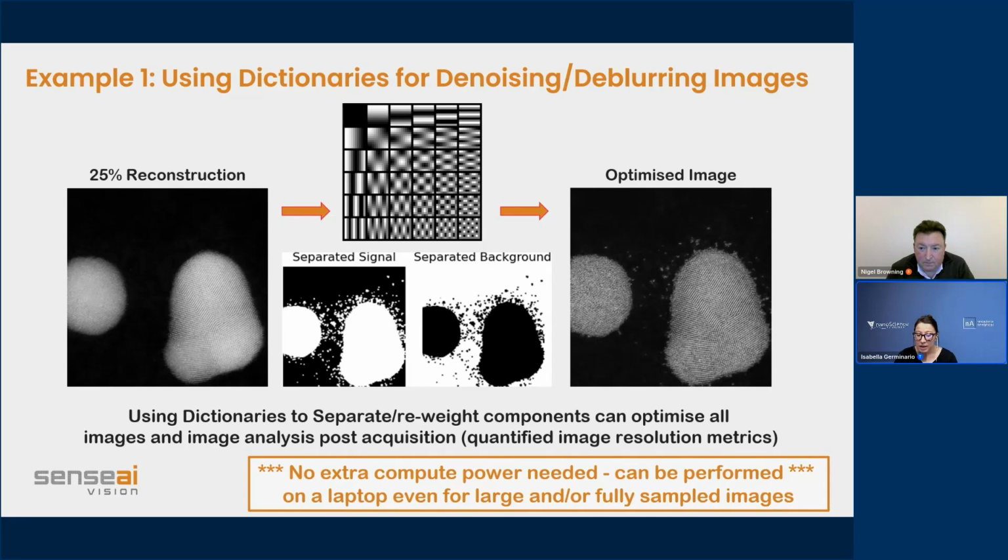So can Sensei also work to visualize electric fields with low dose? Yeah, so if you can get an image contrast out of a microscope or an imaging system, then Sensei can help with that. What it doesn't do is change the contrast mechanism. It doesn't change any of the physics of the processes involved. All it does is say that we can get away with acquiring fewer points, or a lower dose. So it's more noise limited in the process, and it can help with that. It doesn't change the contrast in any way. We're not changing the physics. It doesn't change the process.